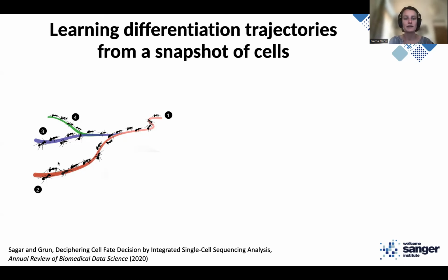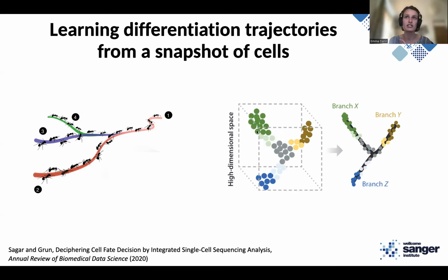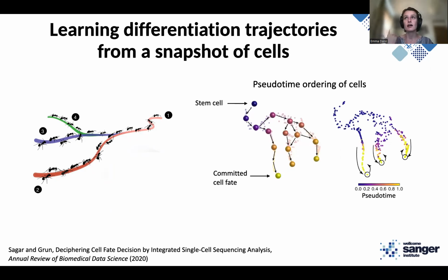So the idea is that in a lot of single-cell data sets, we see similar continuous paths in the gene expression space after we've done dimensionality reduction, etc. And we want to be able to order cells so that the cells that are more similar to each other are probably in the same trajectory of differentiation, and cells that are further away are more likely more differentiated. And again, here KNN graphs are very frequently used.